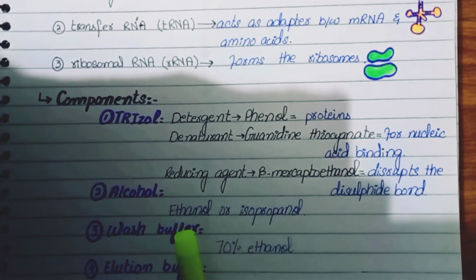Why is it called TRIzol? Because it includes a detergent, that is phenol, that will degrade the protein. After that we have a denaturant, that is guanidine thiocyanate, that helps in nucleic acid binding, DNA or RNA binding. Third, we have a reducing agent, that is beta mercaptoethanol, that will disrupt the disulfide bonds between the proteins.